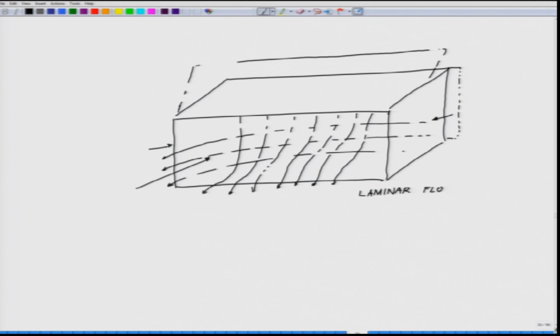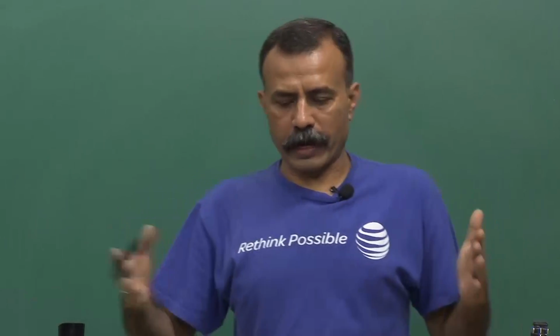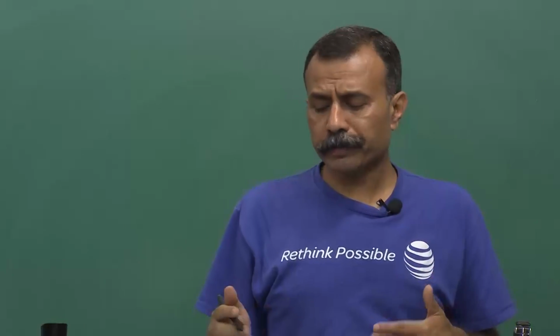All the laminar flow hoods could be either vertical or horizontal. The vertical ones have an additional attachment at the top, whereas the horizontal ones have it on the sides or on the back, mostly on the back.